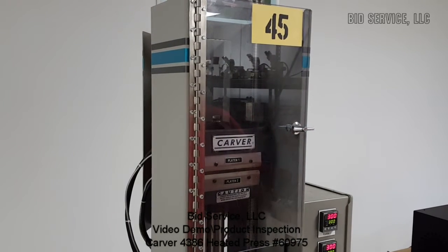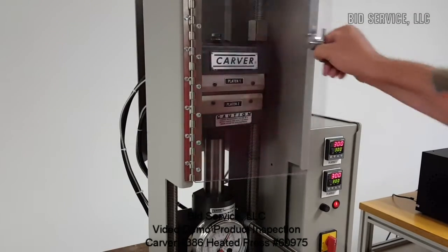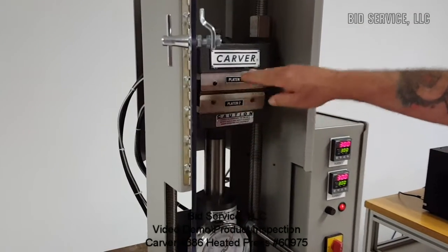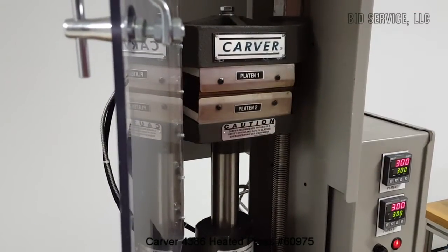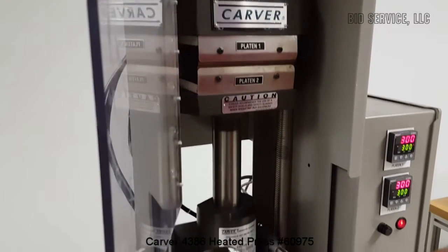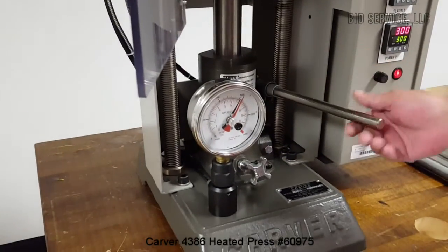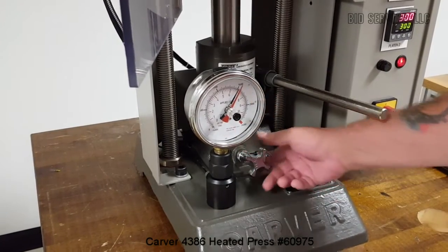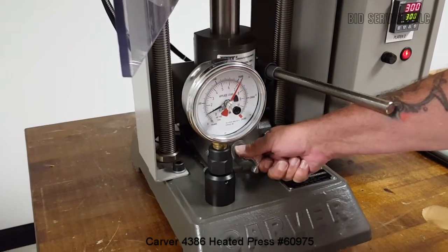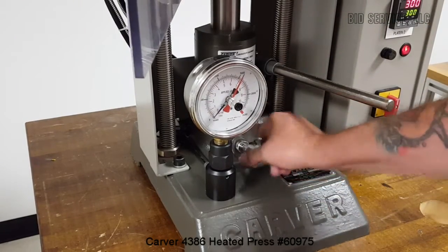This is a Carver heated press. It consists of two heated platens with nothing in between them right now, and is adjustable by a 12-ton jack. To pump it, use the handle here; to release pressure, use the release valve here. You can reach a desired pressure and release it — you can see the needle went down and the platen started dropping.